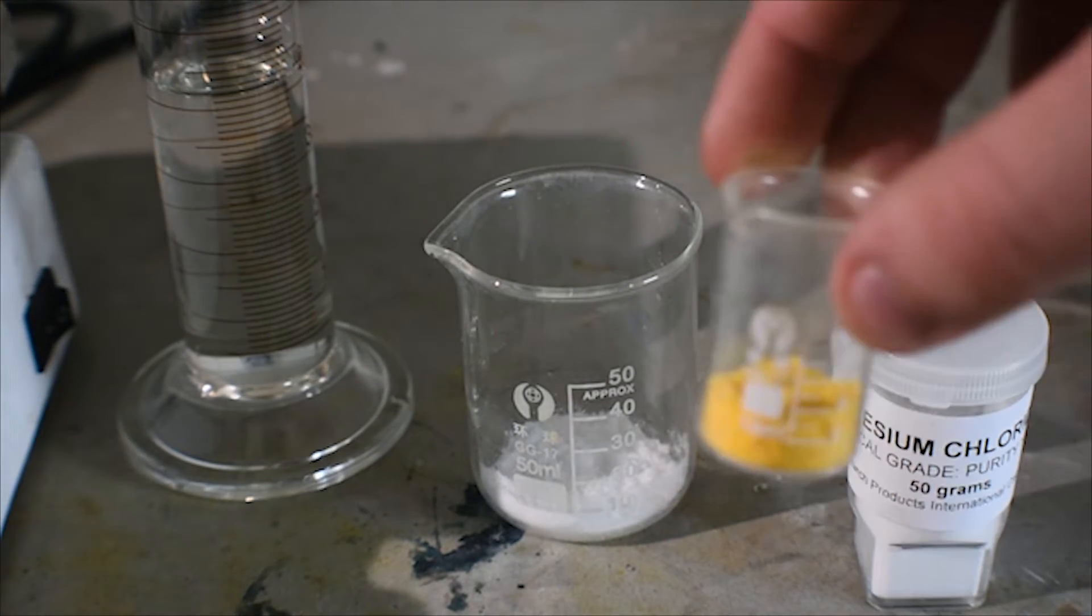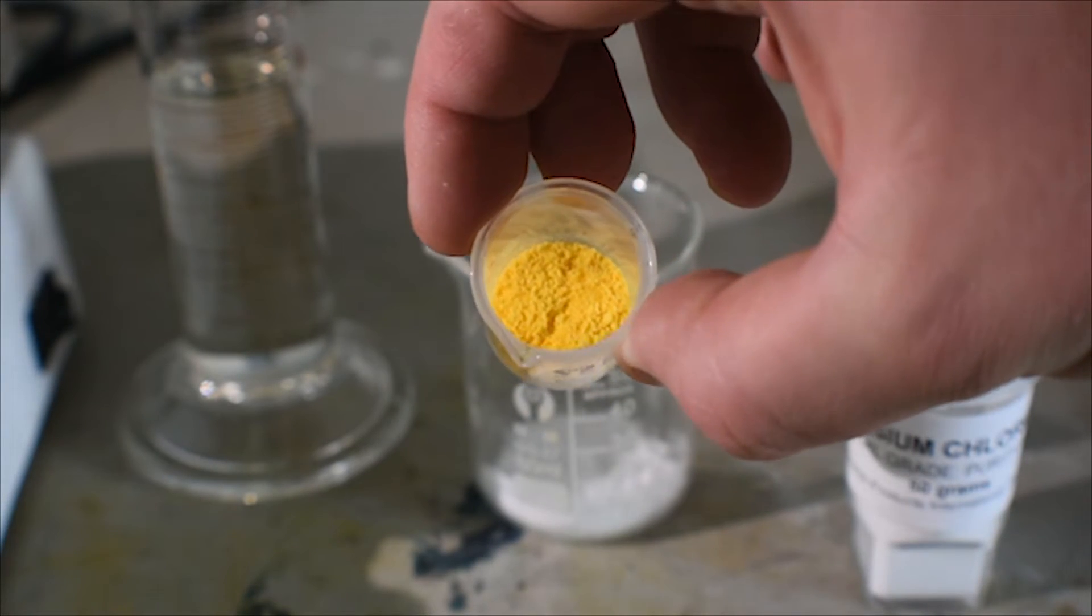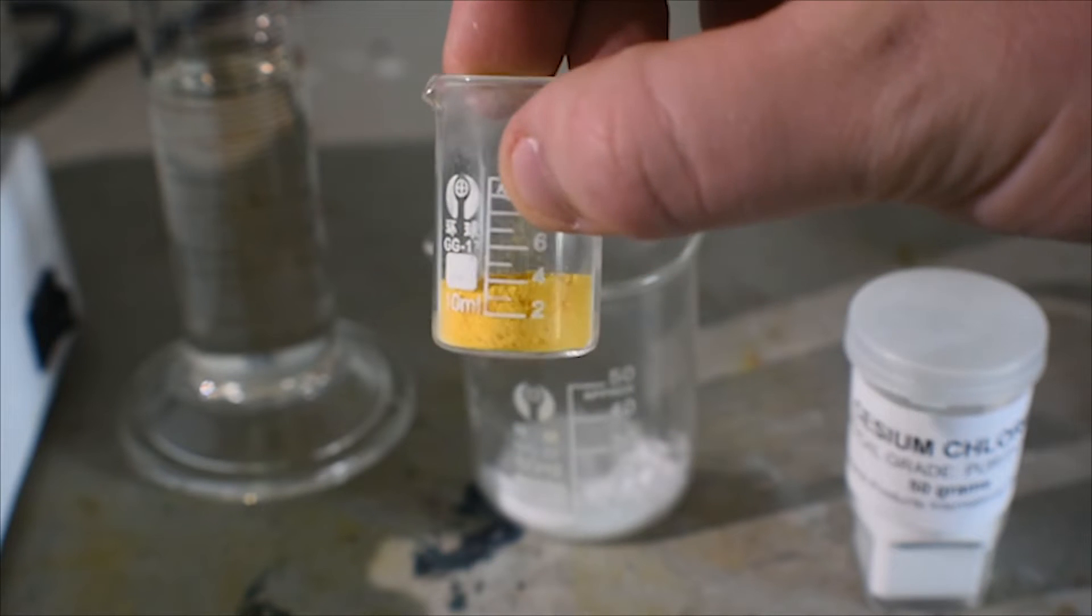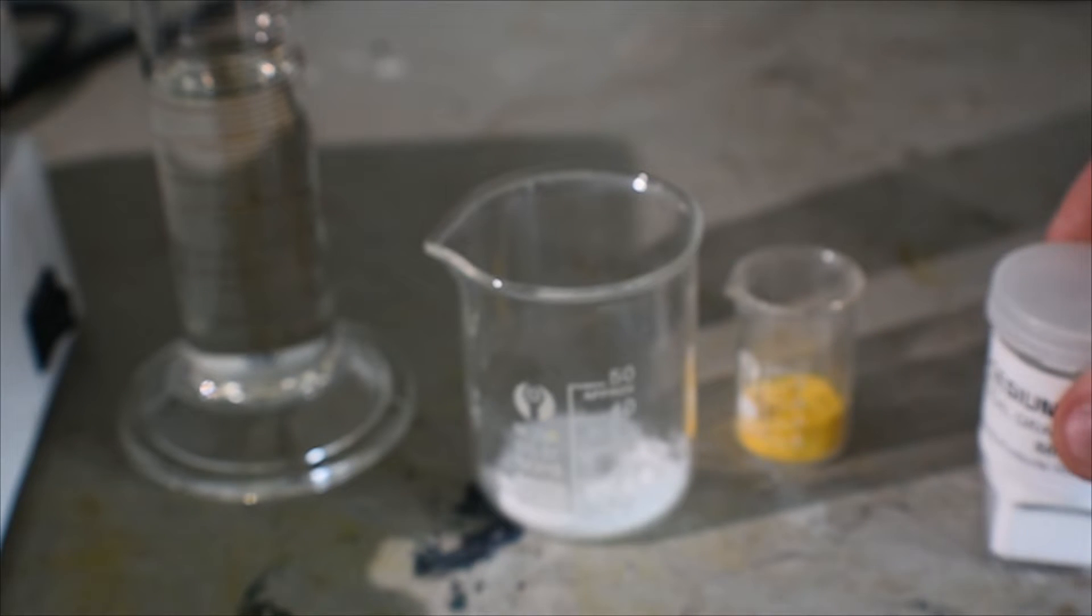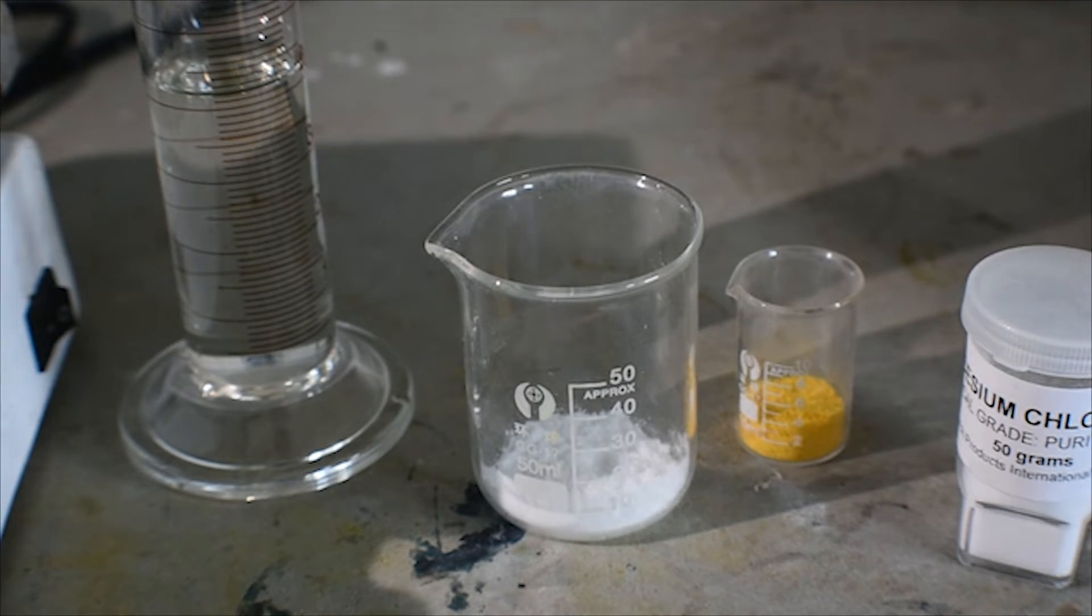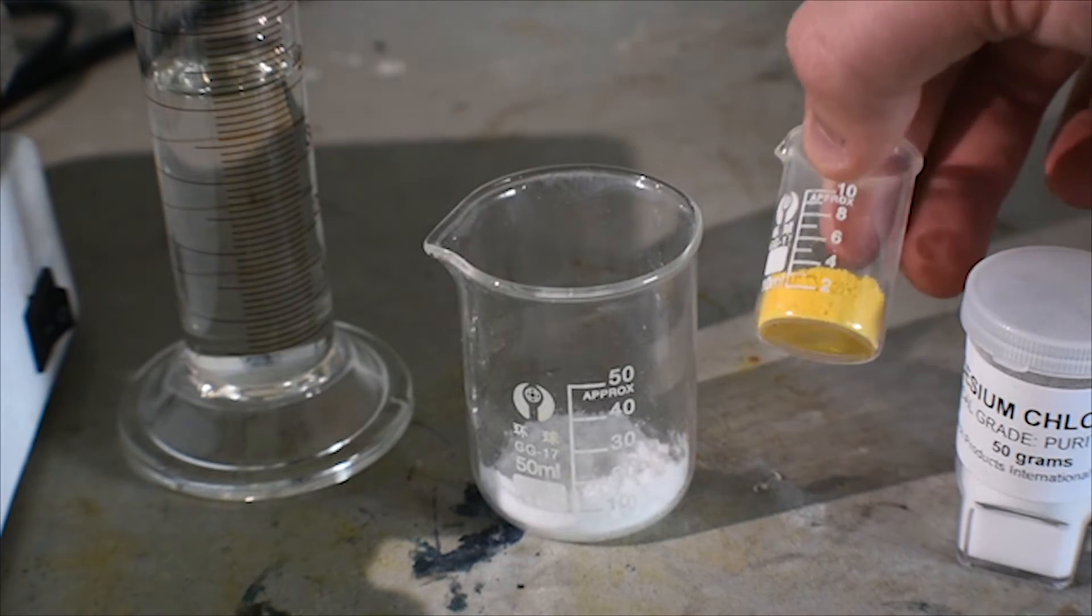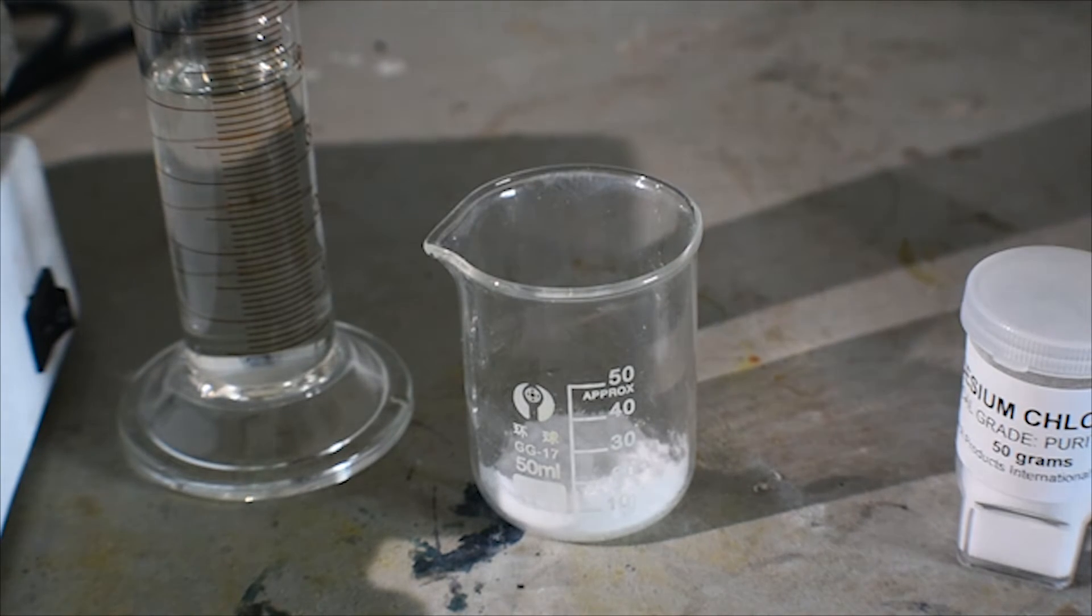Here's what the cesium salt looks like. It's a nice bright yellow powder with a nice little crystalline sort of structure to it. This is formed when cesium chloride is added to the tetrachloroiodate solution. The cesium salt is pretty insoluble and immediately precipitates out as this yellow powder. This can then be filtered and dried to obtain the powder like you see in the beaker right here.